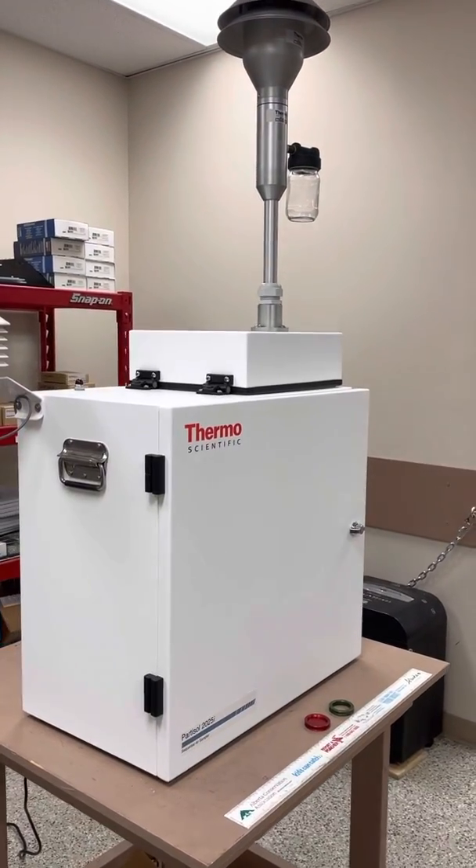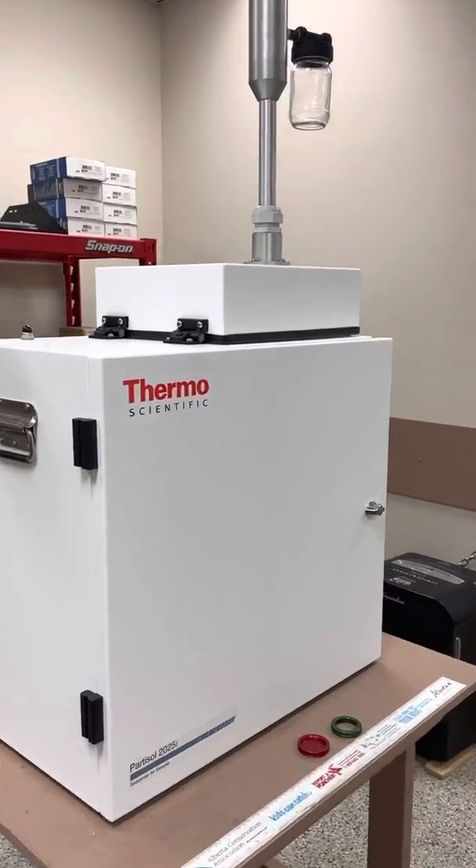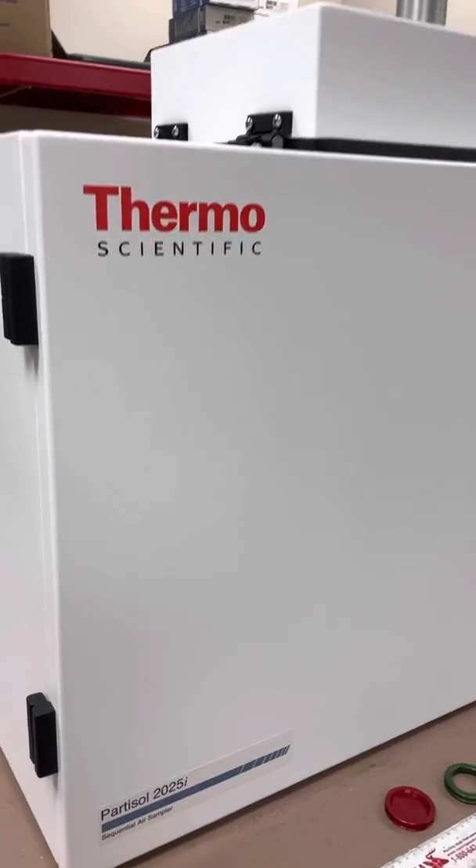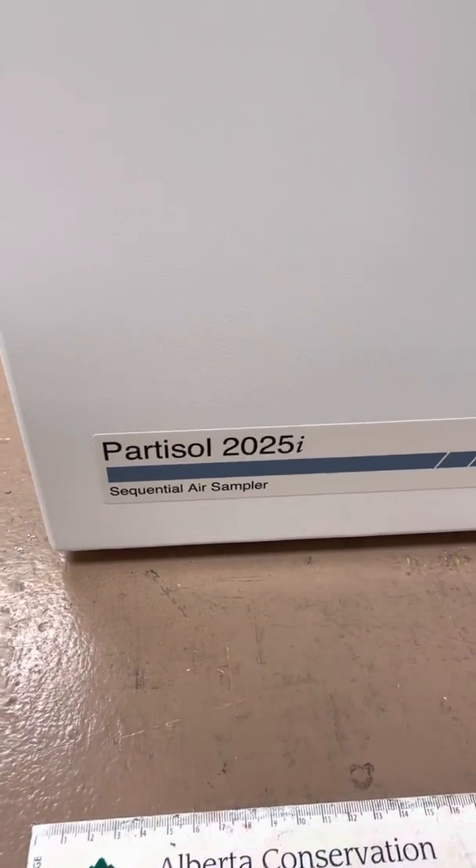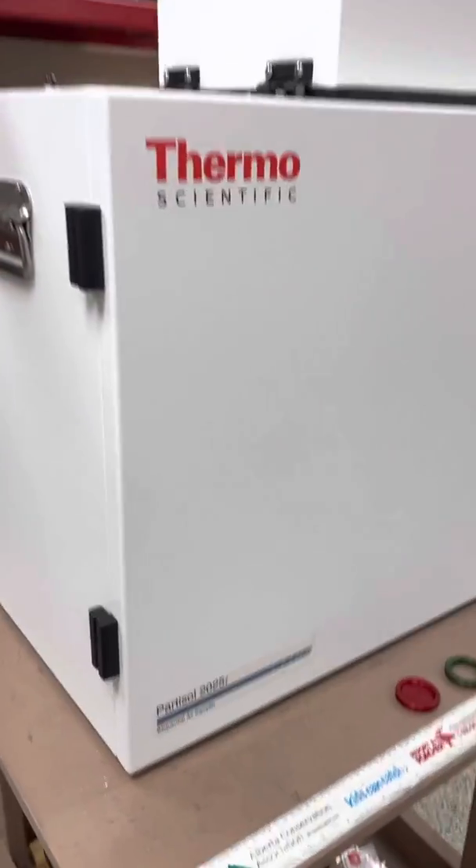Hi everyone, Jim with CD Nova Instruments again, and today we're looking at the Thermo Scientific Model 2025i Sequential Air Sampler — the Partisol 2025i Sequential Air Sampler.